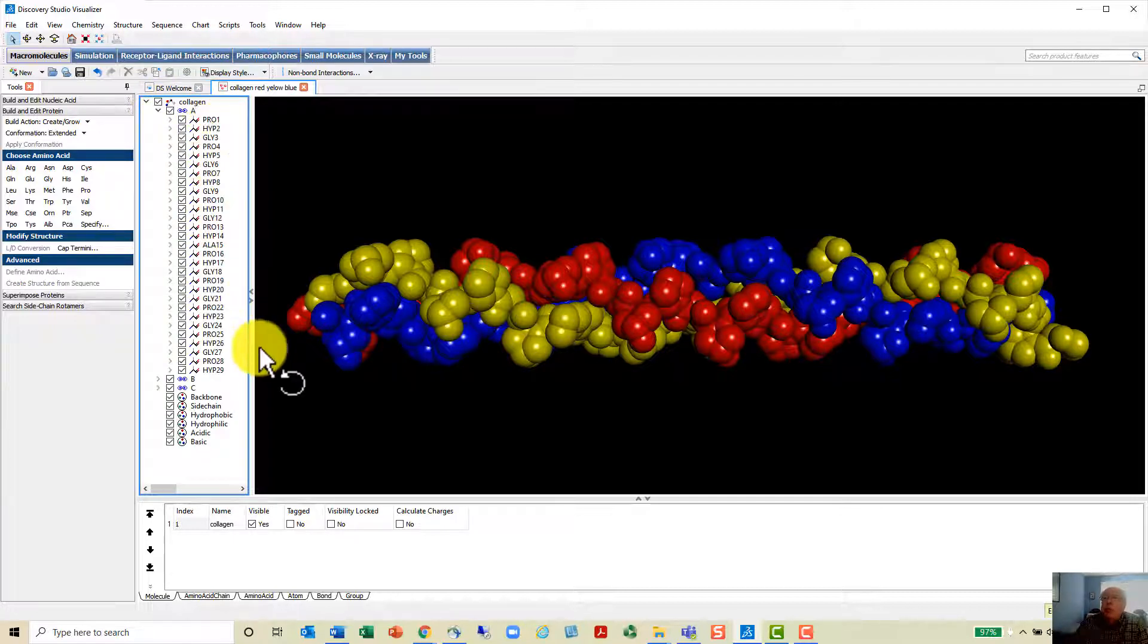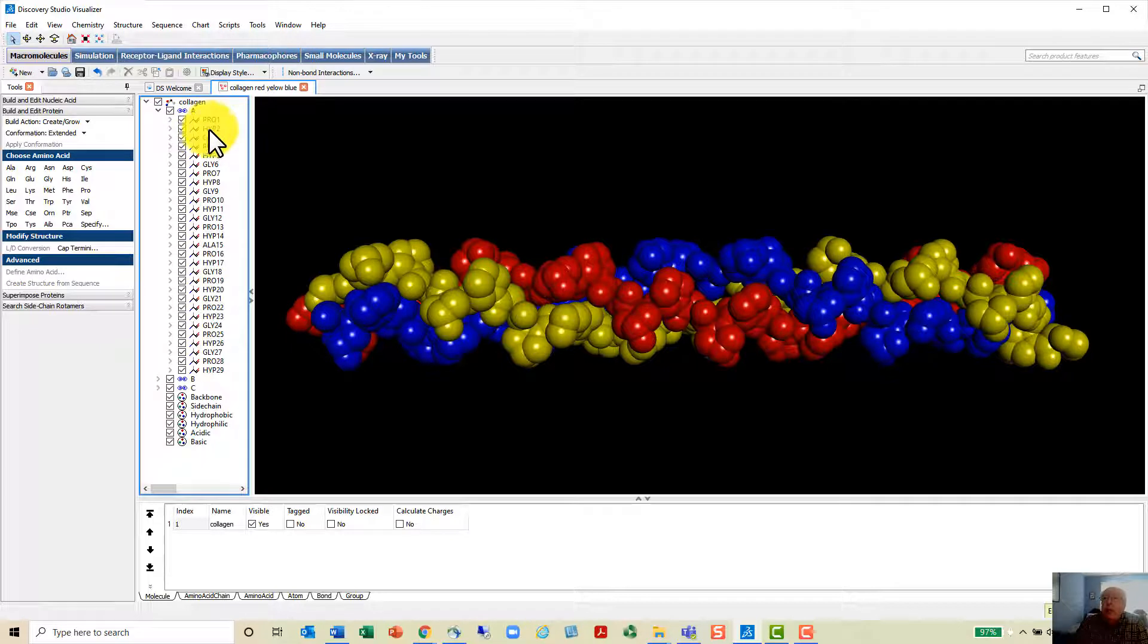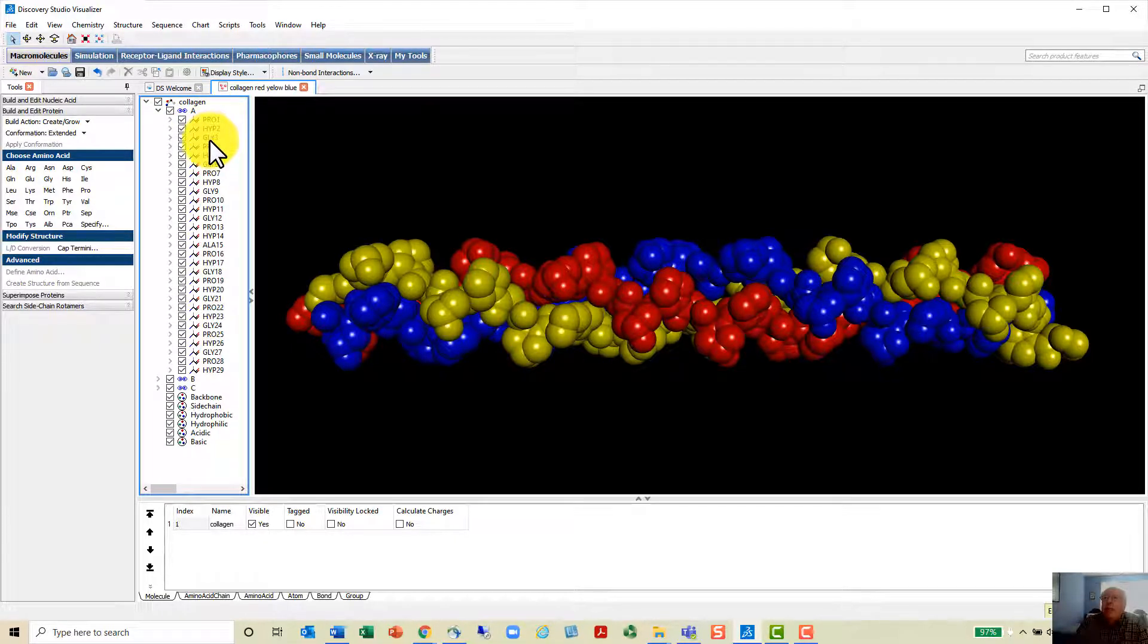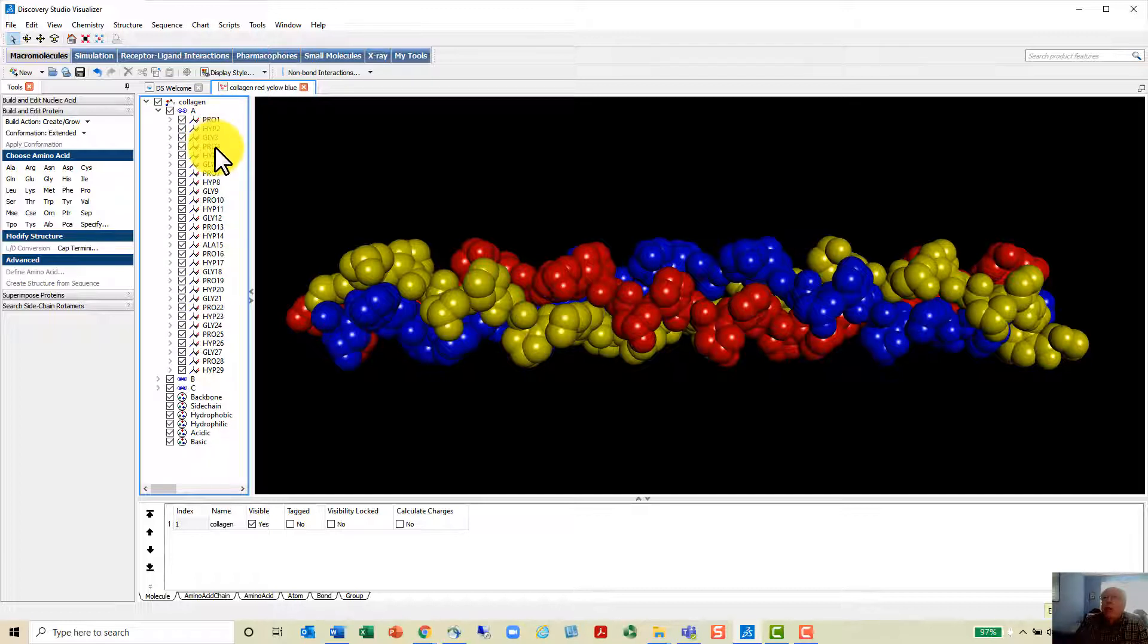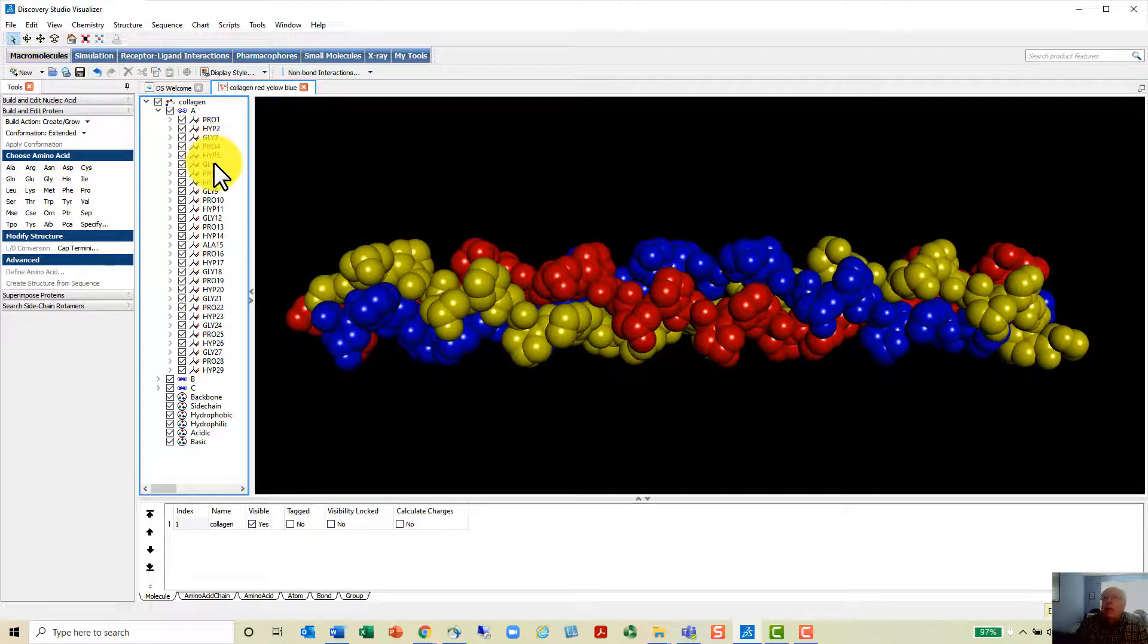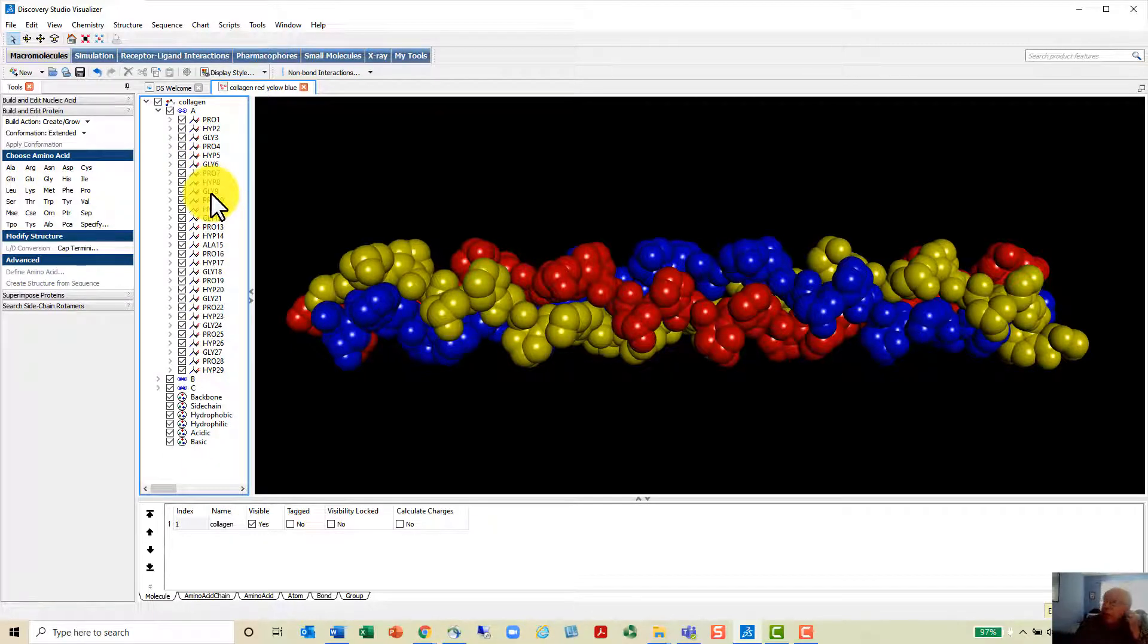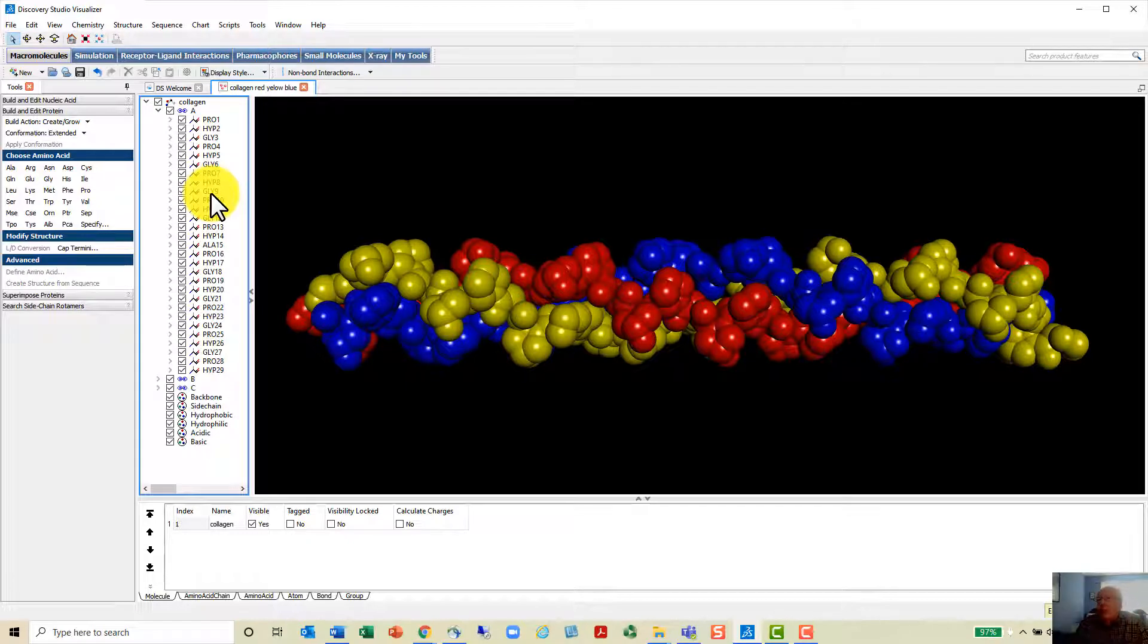You can expand each one of these and now you can see the sequence. Chain A is proline, hydroxyproline, glycine, proline, hydroxyproline, glycine, proline, hydroxyproline, glycine, proline, hydroxyproline, glycine. It's just a repeating structure that's been created.